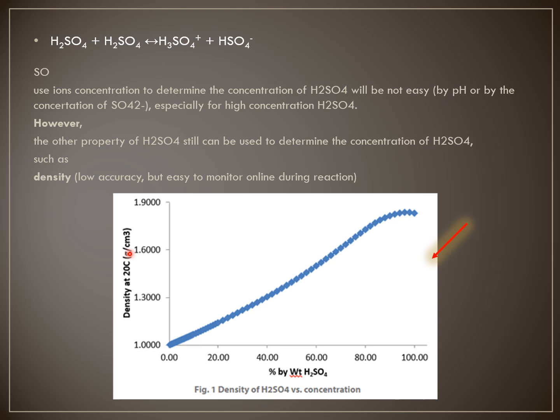Of course, if you have other mixtures inside the solution, it's better to filter the solids out to see the concentration of the sulfuric acid.